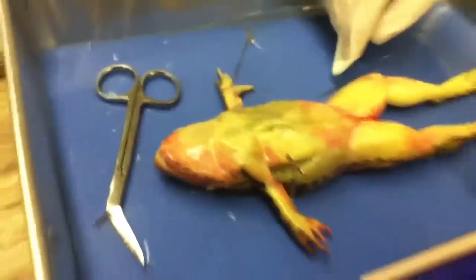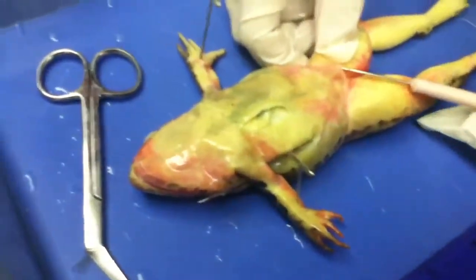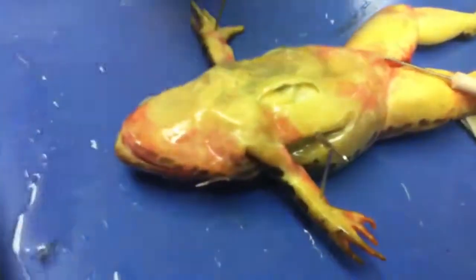Okay, look for the opening located between the hind legs. So I think that's right here. Look. Okay, don't worry so much about getting all the pictures. We need to start. Yeah, we're opening. Okay. Yeah, we're about to cut the legs.